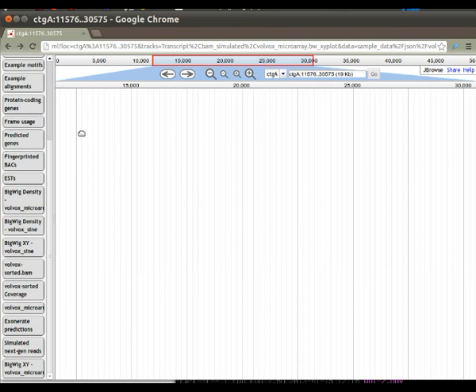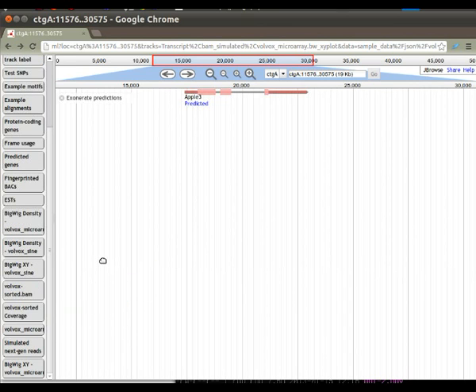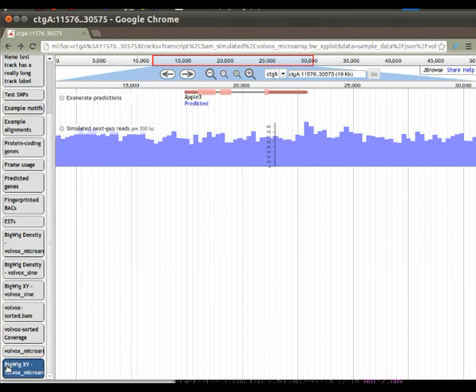Like most genome browsers, JBrowse lets you scroll back and forth through a genome, displaying data in multiple tracks on the screen. For this demo, we're using a set of artificial test data. Let's turn on a few tracks. We can either drag them from the track list on the left into the main display pane, or we can double-click them.